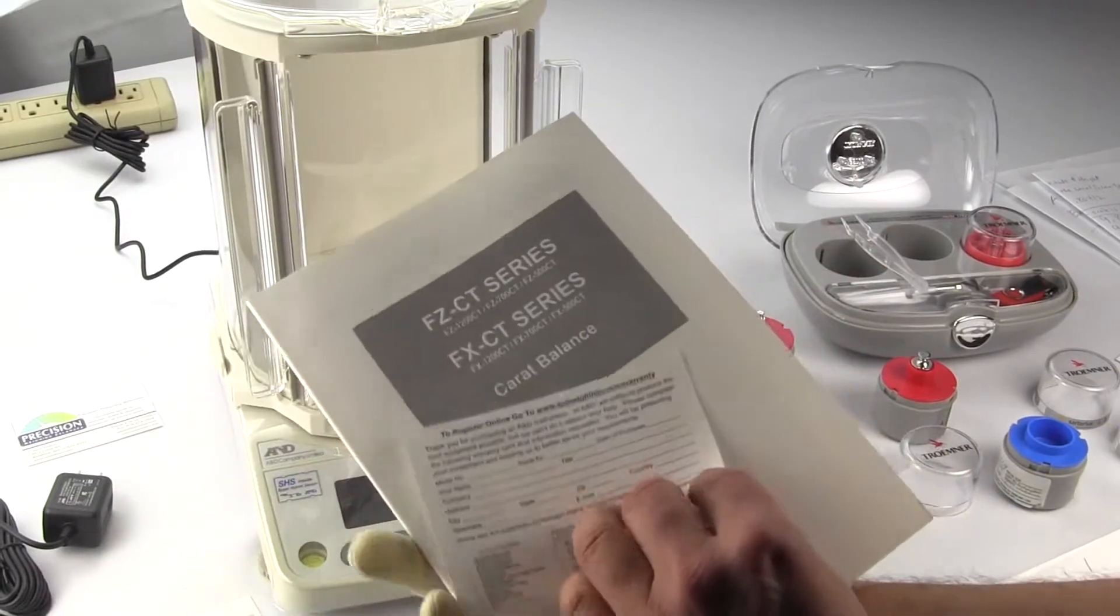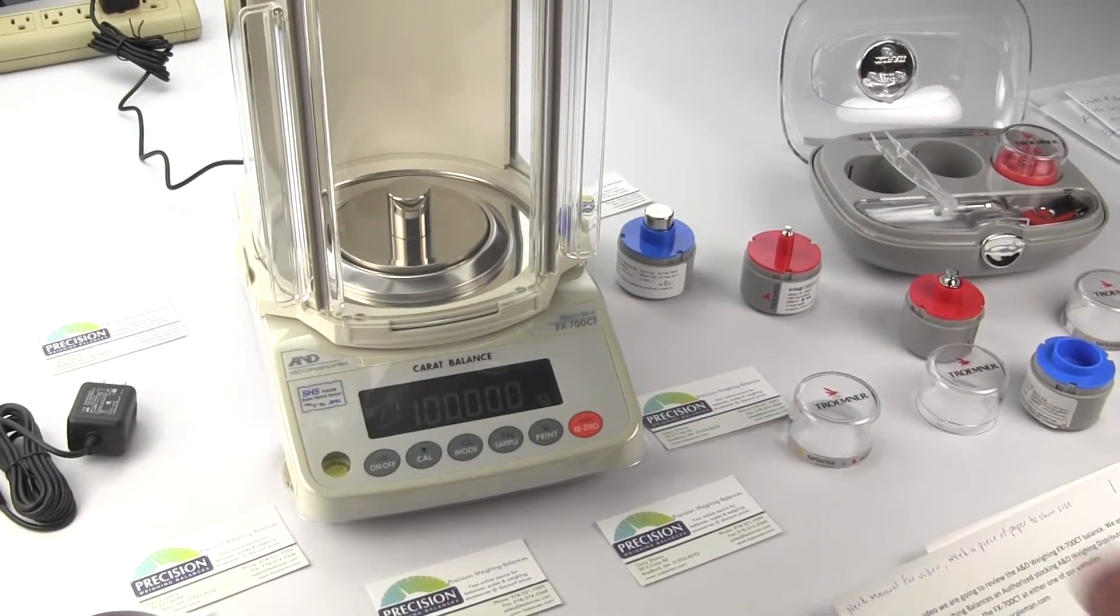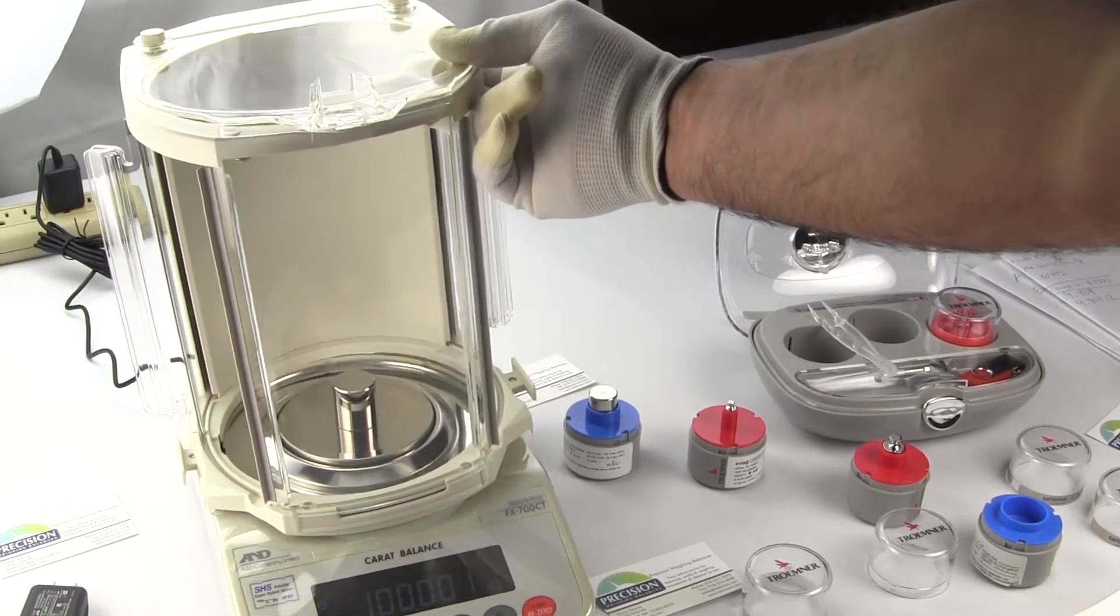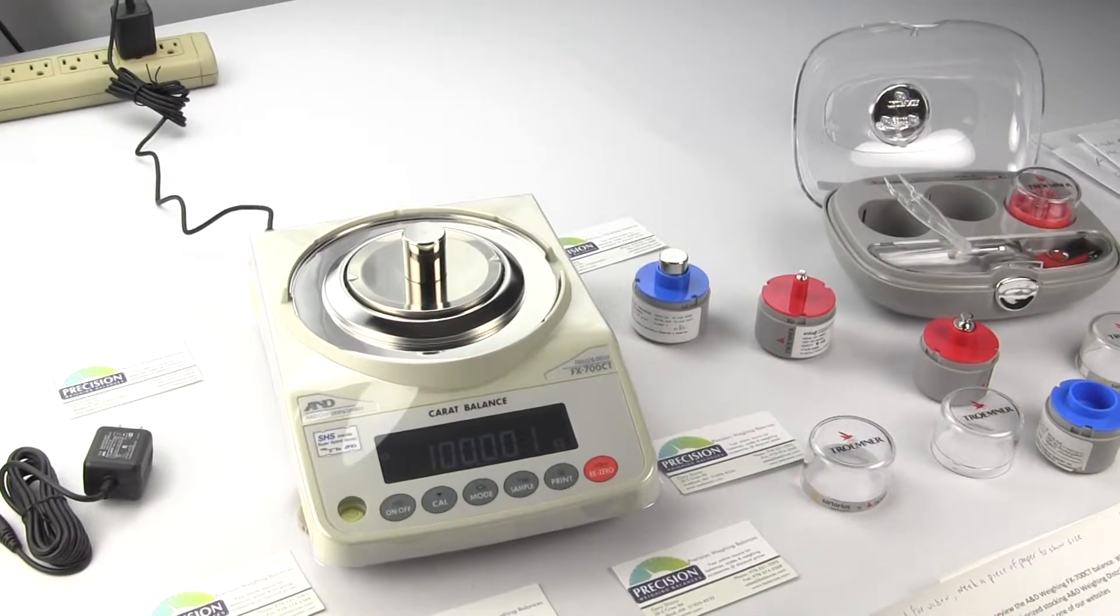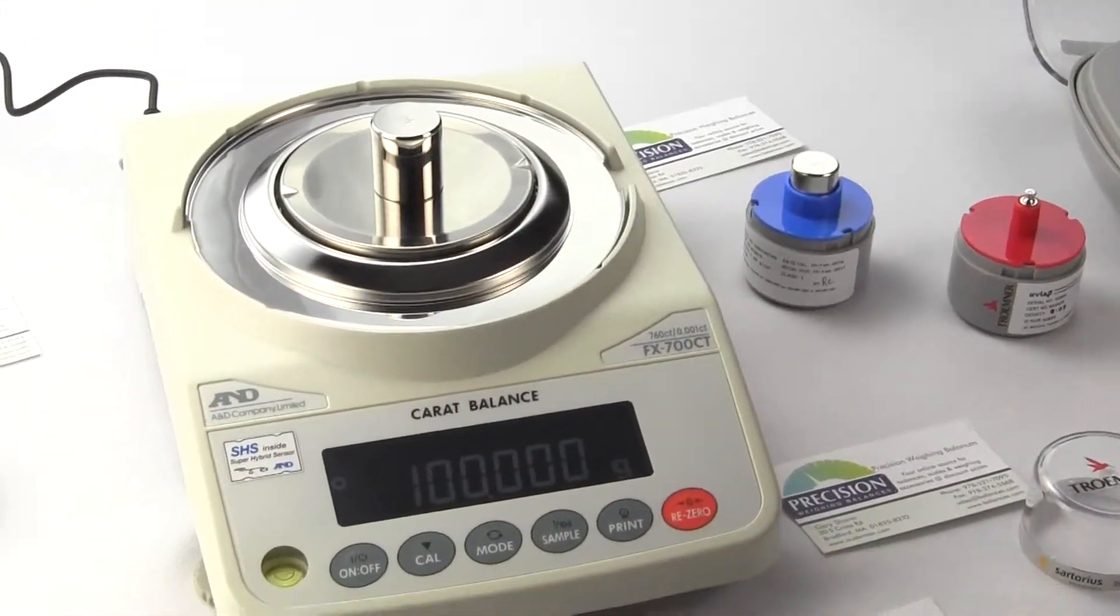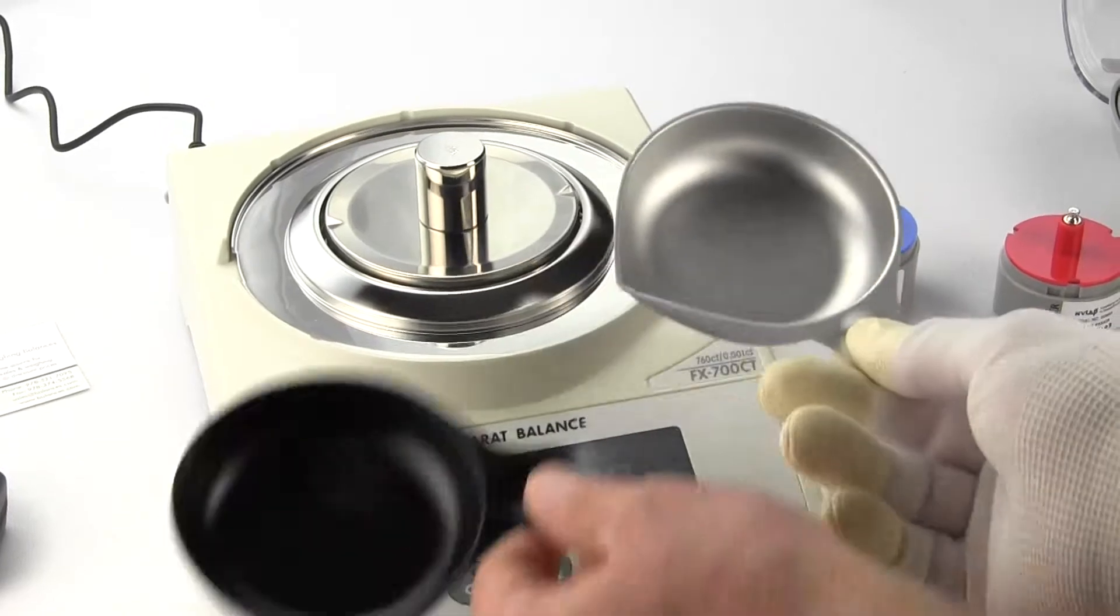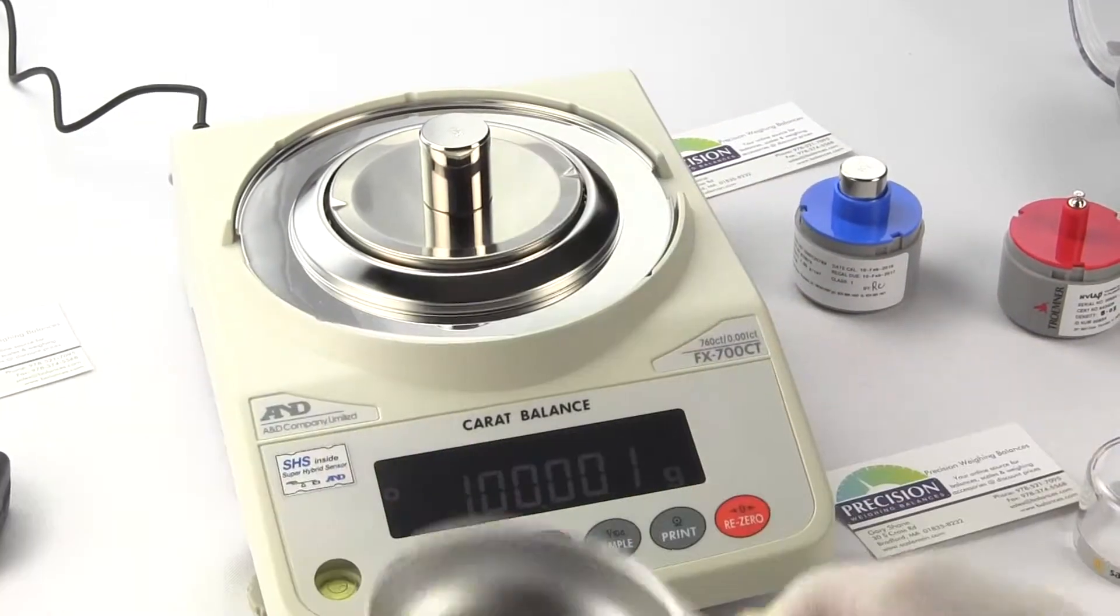You'll also receive a warranty card. There's a form-fitted plastic in-use cover so this draft shield can be removed. You just need to pop out the tabs so the draft shield comes off. This is an in-use cover. One comes standard with it all together. You also receive two gem dishes since this balance is really marketed to the jewelry industry. A&D supplies them with two gem dishes.